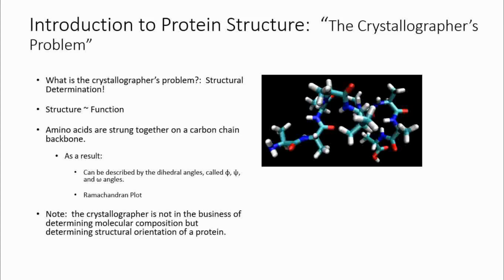Now why am I emphasizing these structures? The basic reason is, I think all of you can very easily correlate that when a protein is denatured due to temperature, pH or any other chemical reagents, the structure of the protein gets disoriented, right? To be very simple, when you break the chains or the foldings of the protein, it becomes a linear sequence of amino acid chain, that's it. But the biggest problem with this is that the functionality of a protein is very much tied to its structure and its foldings. So if I make a protein linear, the function of that protein is lost, and that is why the structure identification, elucidation, or determination of a protein is a very crucial point, right?